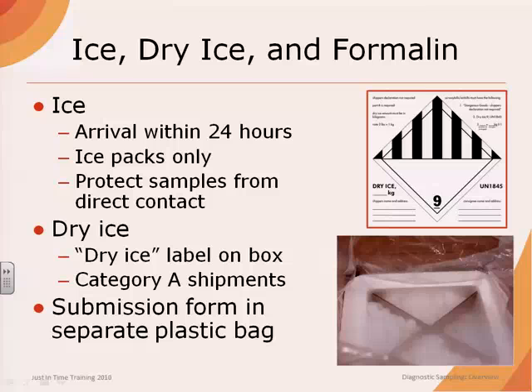When packaging samples that require ice for shipment, use only ice packs, picnic packs, or sealed ice containers. Never ship with cubed or crushed ice, even if it is sealed in a plastic bag. Samples should be protected from direct contact with ice packs to avoid being damaged by freezing temperatures. Samples shipped on ice should arrive at the diagnostic lab within 24 hours.